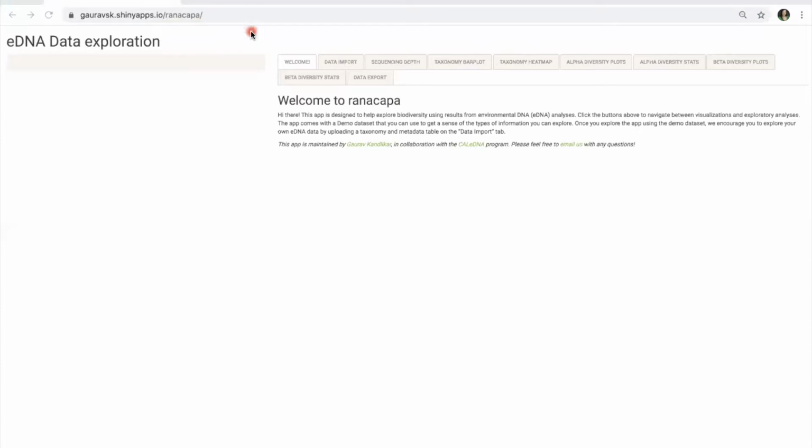Like the DNA Subway tutorial, I'm going to try to be as brief as possible with this tutorial, although there are some additional concepts that we will have to cover so that you'll be able to interpret the graphs and the results of the community analysis. So this might be a bit more involved than the DNA Subway tutorial, but I'll try to keep it brief.